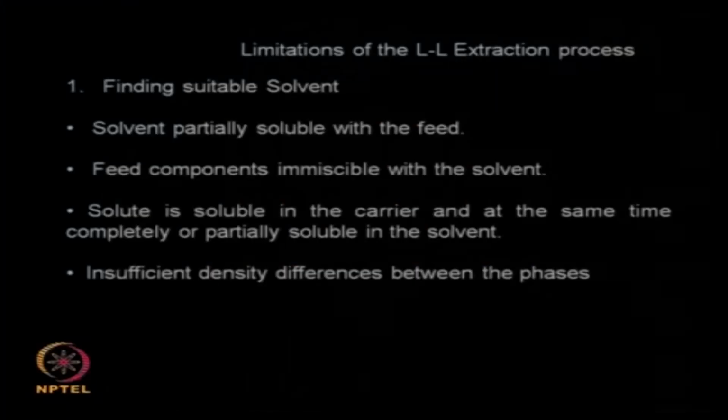Now let us go to the limitations of the liquid extraction process. We have looked at a large number of extraction approaches. We have looked at mathematical relationships, we have looked at aqueous systems, we have looked at the reverse phase approach, we have looked at the affinity approach and so on. So there are many limitations of liquid extraction, it is not 100% the best. We have to find a suitable solvent, so that is one of the headaches.